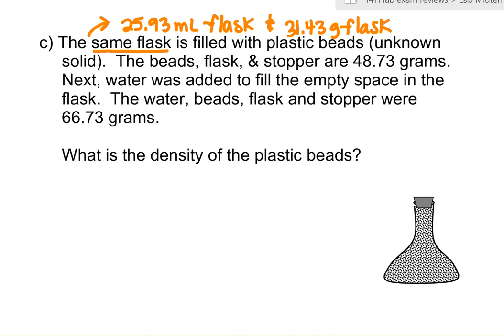If you're not sure how to get the volume of the flask, you need to go back to the density of the liquid video. But anyway, it's the same flask, and I'm going to fill it with some kind of beads, and I'm just going to show it. Most of the time you don't fill it completely. There are gaps in there that the solid doesn't fill. Then you weigh it with the beads, and that allows you to determine the mass of the solid.